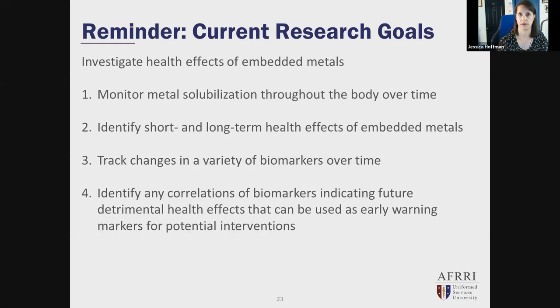One of the other features that's nice about this is that metabolic cages are a huge pain and they're hard to clean and they're very expensive. So if you can use the lab sand instead, while it can't be your first feature for actually choosing an alternate method, since it's a comparable method, the fact that it's also easier to use is a bonus.